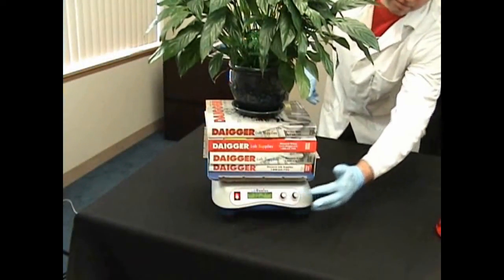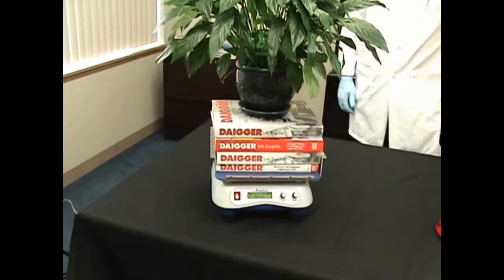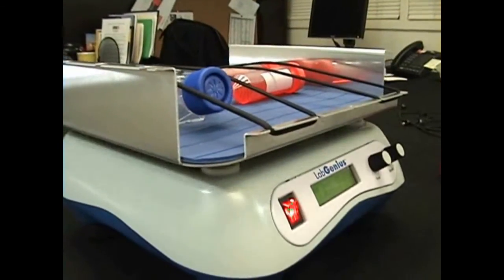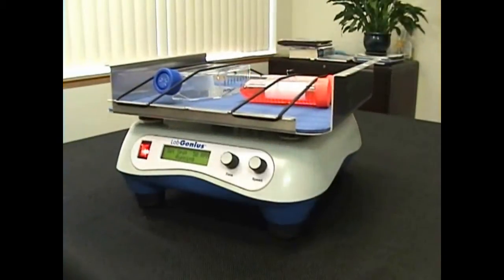Maximum load is 4.5 kilograms or 10 pounds. Shaker can be used in incubators from 4 to 40 degrees Celsius with a non-condensing humidity of 80%.